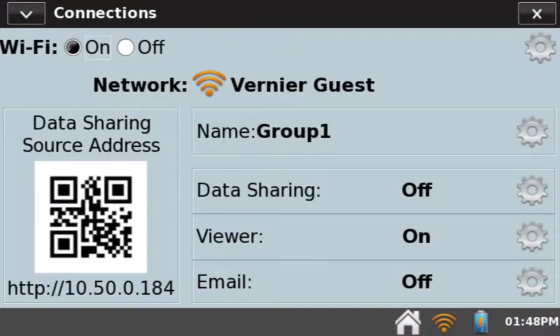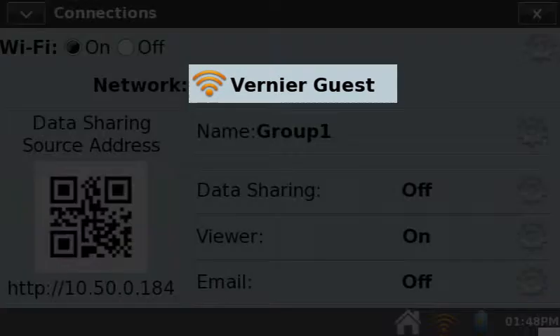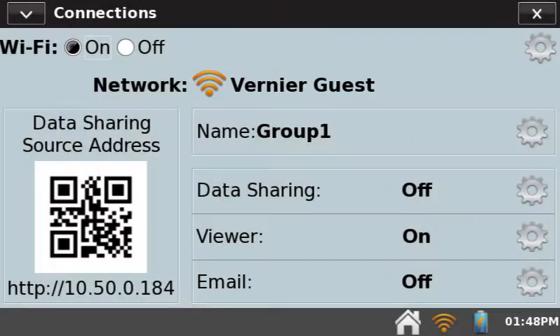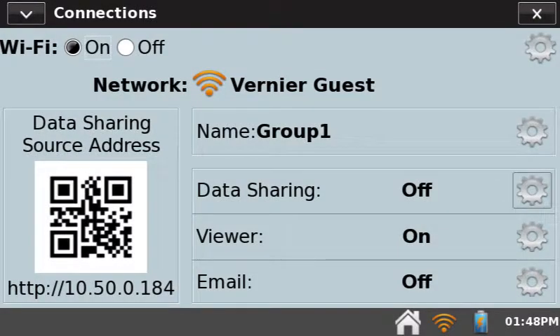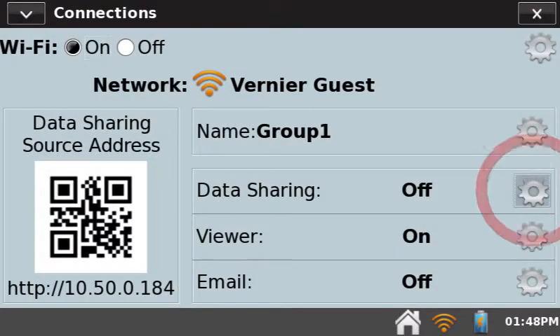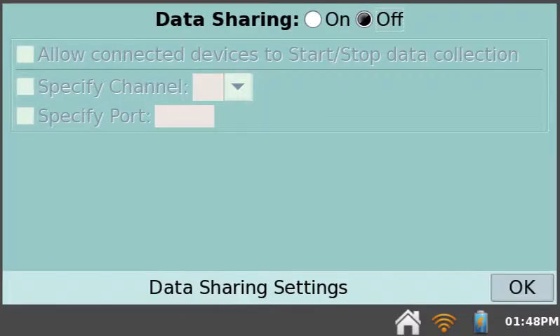Be sure your LabQuest is connected to your preferred network. Tap the gear associated with data sharing. This opens the Data Sharing Settings dialog.